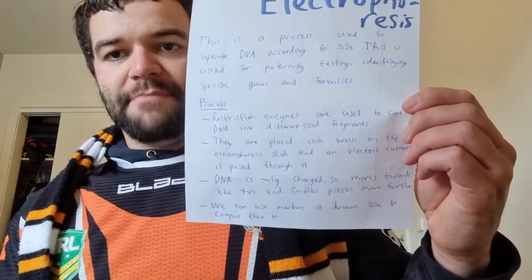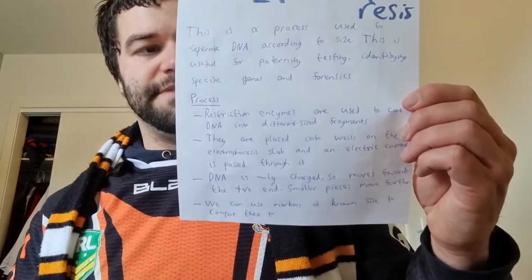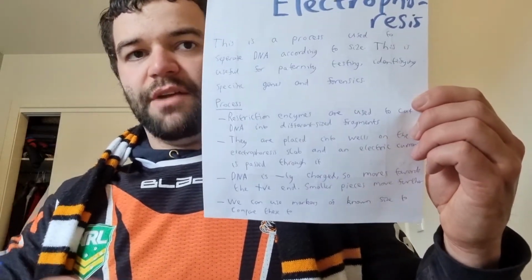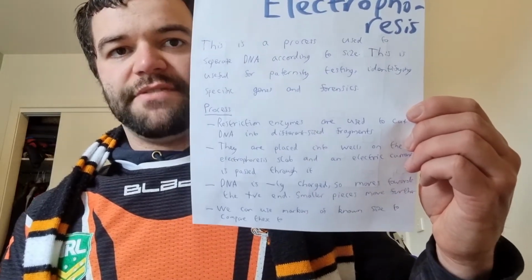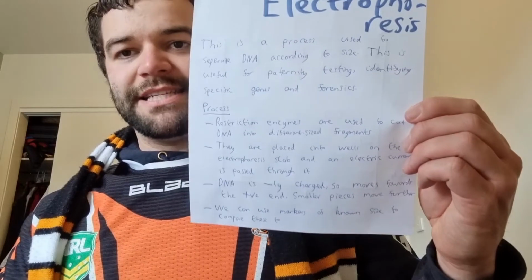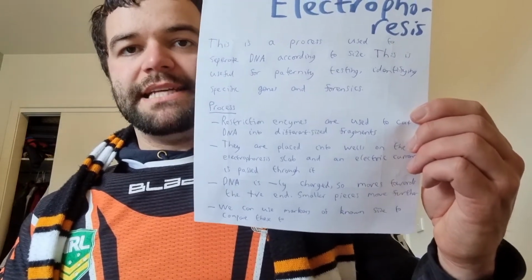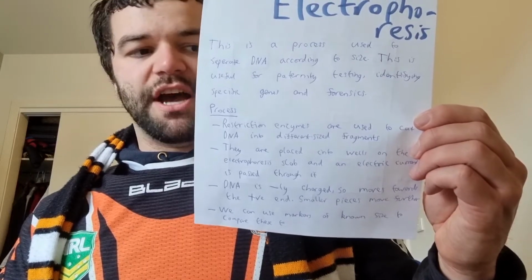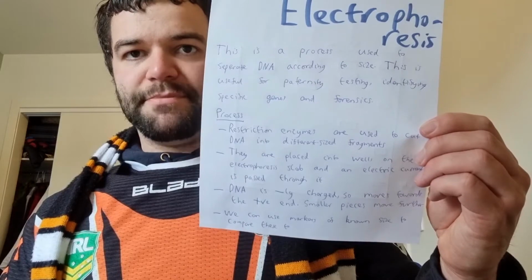So an electrophoresis slab basically has little wells at the end of it, and then it's got a positive to negative end with a gel all the way through it. So we load them into the wells of the gel electrophoresis slab, and then we pass an electric current through the DNA fragments. DNA as a molecule is negatively charged, and therefore it will move towards the positive end of the slab.